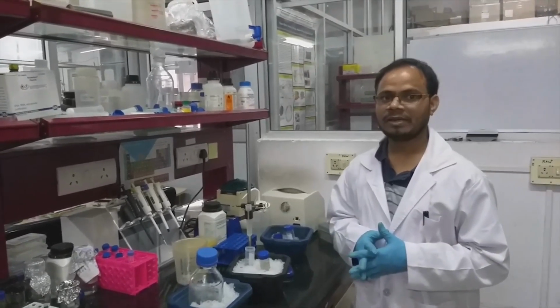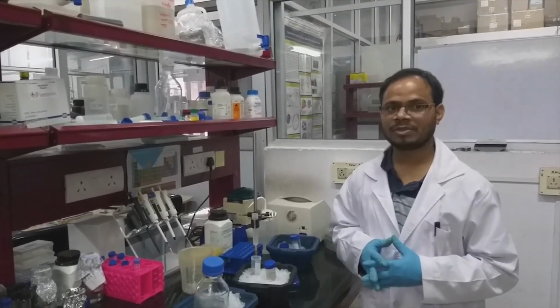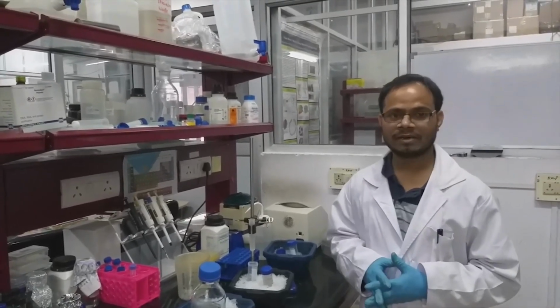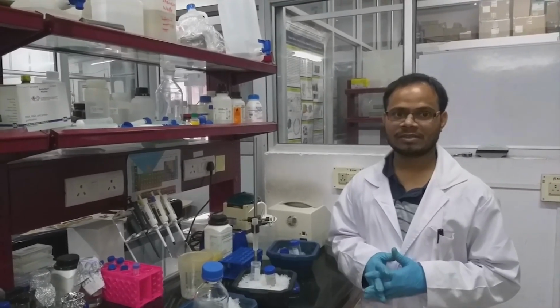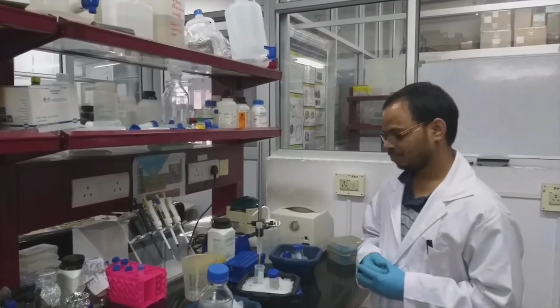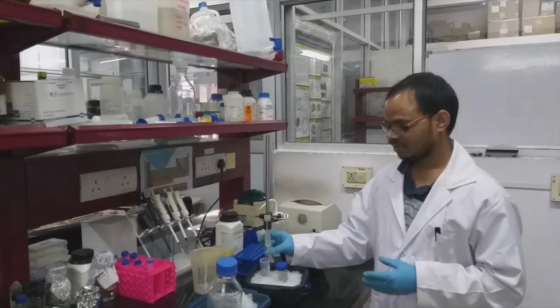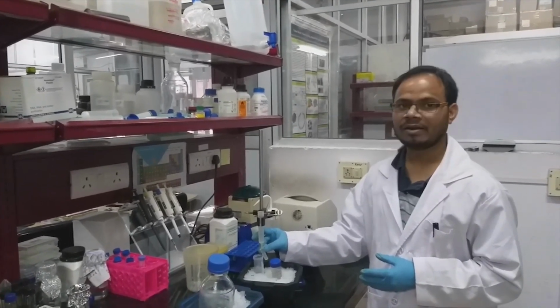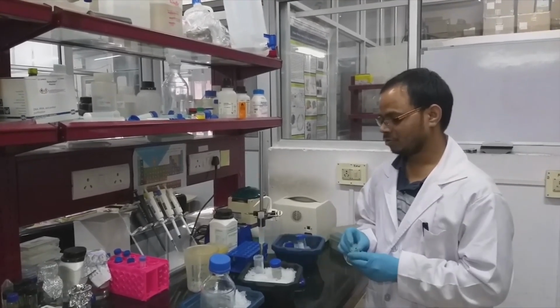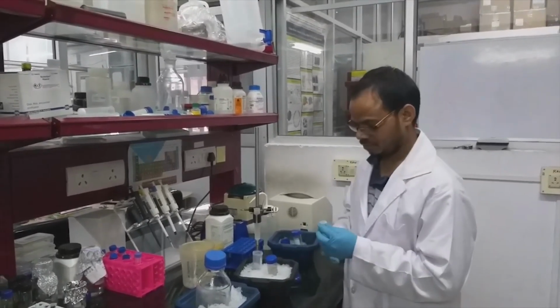Say you are getting only 10% of the protein in your purified fractions, and 90% of the protein is eluting in the flow through. In that case you can reuse the flow through for purifying the protein again. So you have to collect the fractions in small microcentrifuge tubes, and we have to save those fractions, label them and save.